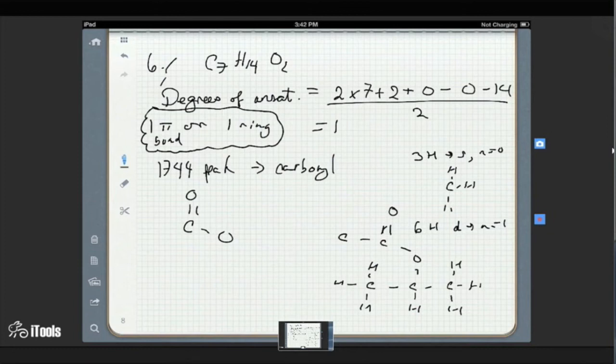But then we only have 5 carbons accounted for: CH3 and CH3, so that's 1, 2, 3, 4, 5. So we have 2 more carbons. Maybe I'll put the CH2 right next to the other CH2, because it's pulled in. So maybe there's a methyl ethyl on the C next to the O from the ether.